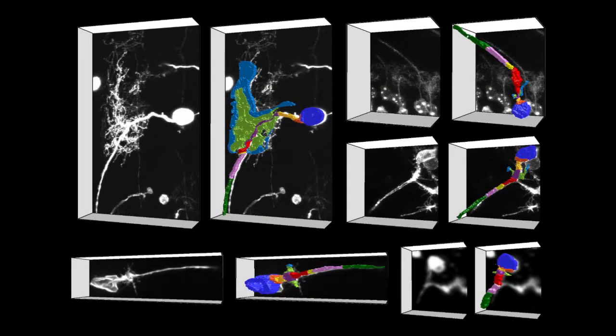Our results indicate successful segmentation performance, which is mainly due to the consideration of the structure information in both global and local transformations. The global transformation exploits the neuronal morphology directly by describing the volume with respect to the axonal centerline, while local transformation integrates the centerline location term into the objective function, which makes the MRF framework take into account both compartment shapes and volume structure.